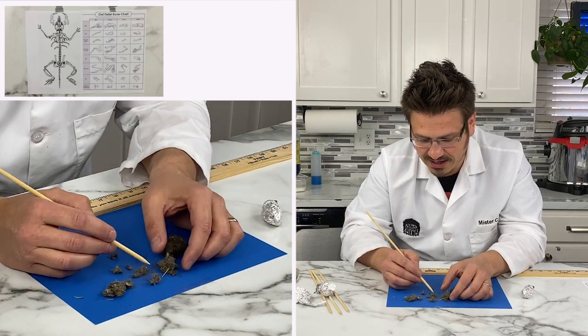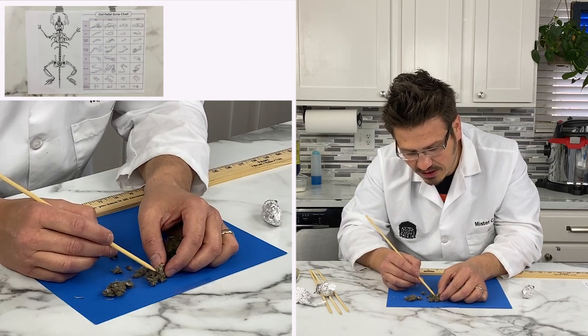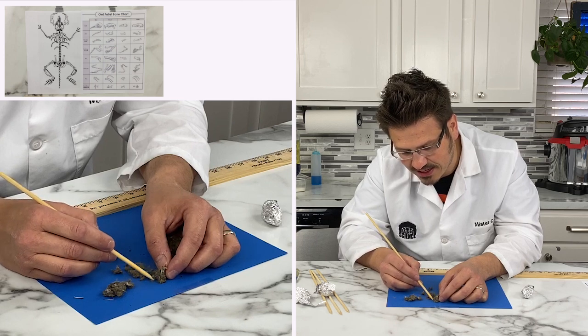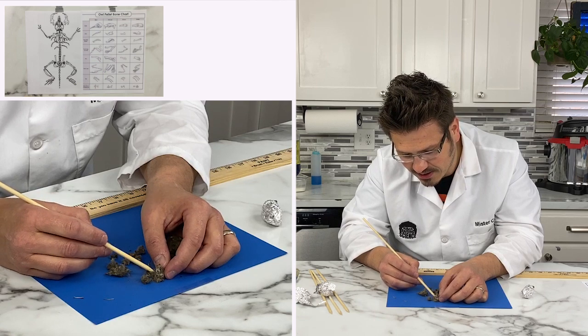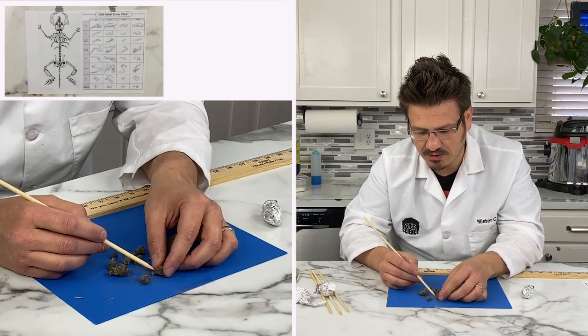Oh, cool. I think I have a skull right here. I'm trying to get to it without breaking it. Oh, I have a skull. It's a small skull. I don't know if you guys can see that. Can you see that? Am I in a good spot? You're in a good spot, but it's just very tiny. It is tiny. Come a little closer, hold it up to the camera. I will. Here in a second.